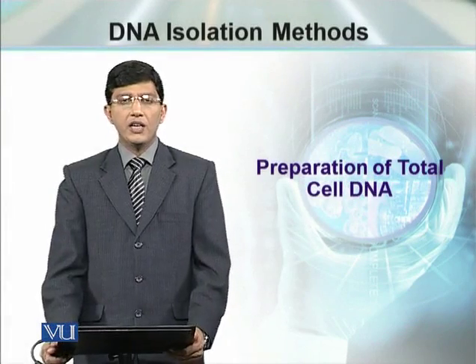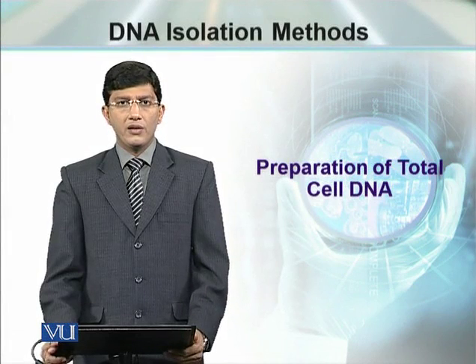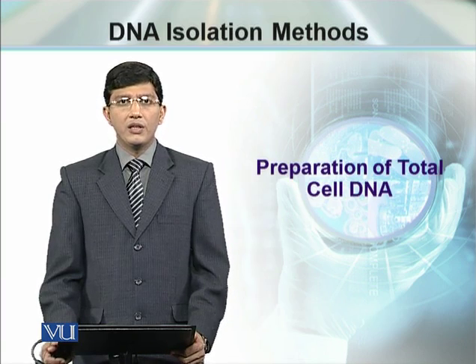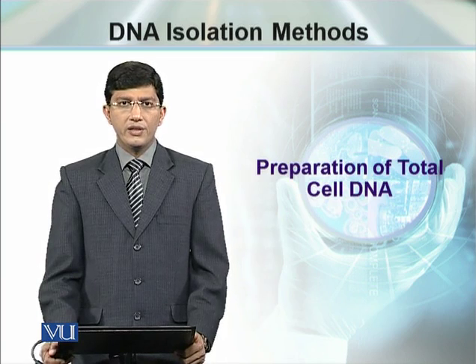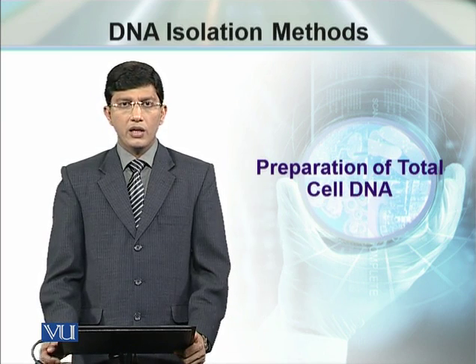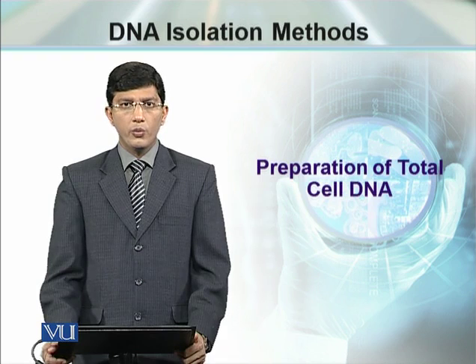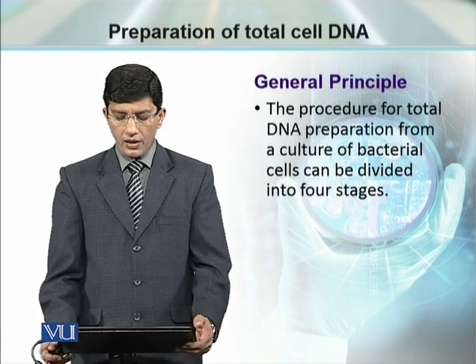जैसा कि हम कल्चर मीडिया के हवाले से बात कर चुके हैं, बैक्टीरियल कल्चर और माइक्रो ऑर्गेनिज्म कल्चर once it is established, बायोटेक्नोलॉजी में जो नेक्स्ट स्टेप है that is to isolate the DNA for further study. This study can be of different types, but we are at the moment going to talk about the isolation of DNA, how many steps are involved, and how we can go further with isolation.